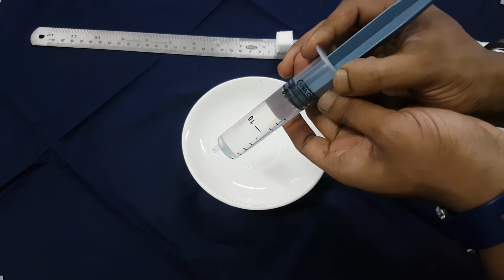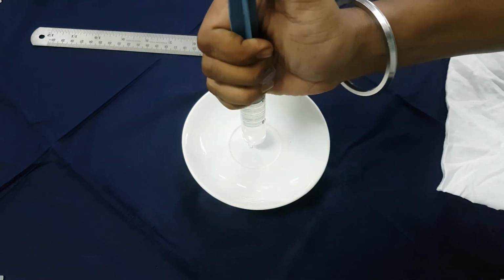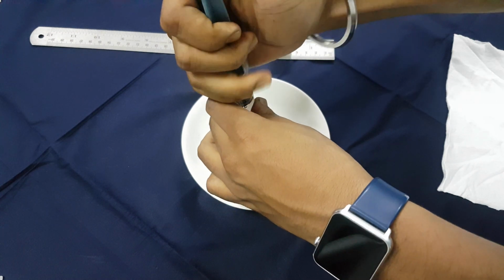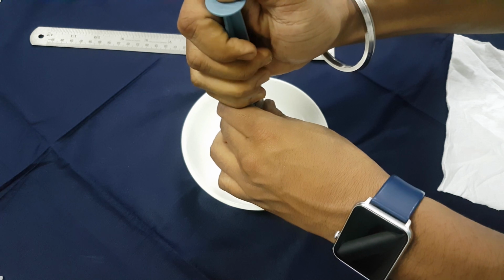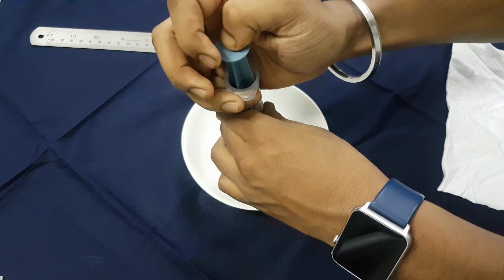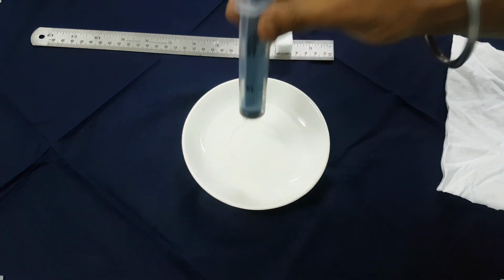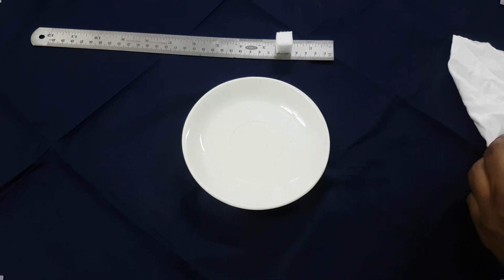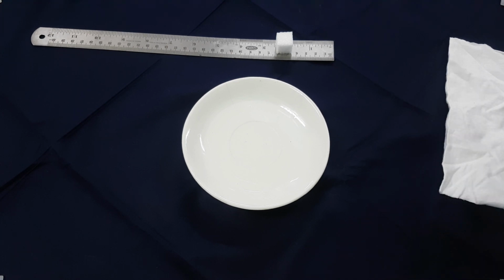20 ml silicone oil in the container that we have here. Come on. Yeah, that's the trickiest part that I have. And we are done. Yeah, it's good. That's 20 ml silicone oil for you.